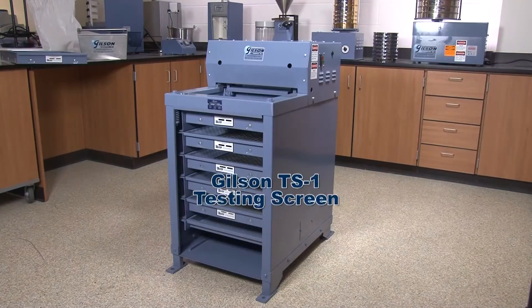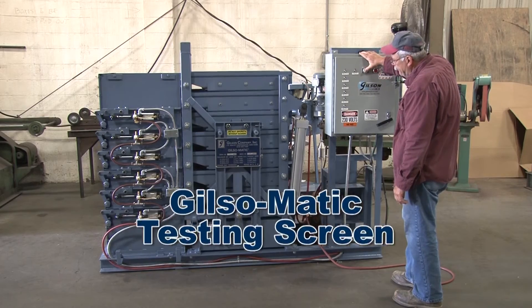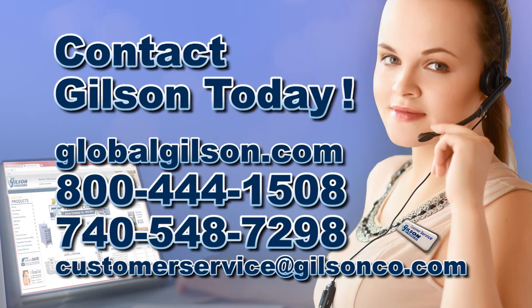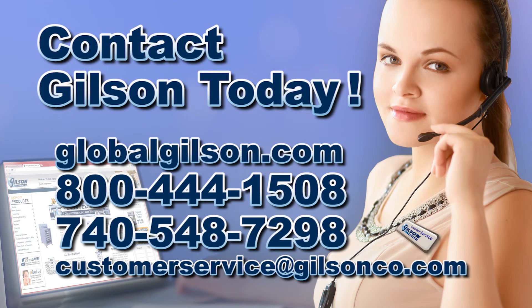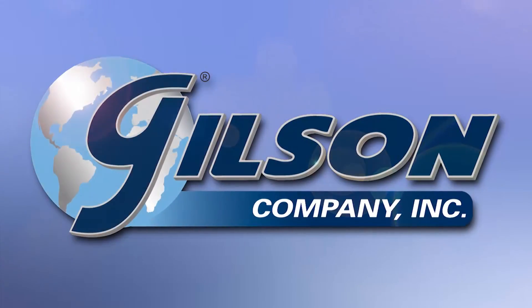From the industry gold standard TS1 testing screen to the automated Gilson-matic screening assembly, Gilson has the right equipment for your particle size determinations. Be sure to check out these and all our testing screens listed in the Gilson catalog and on the Gilson website. Gilson — your industry leader in material testing equipment.